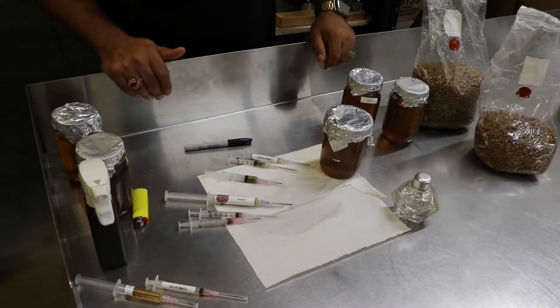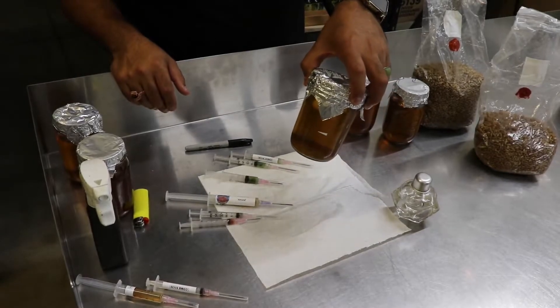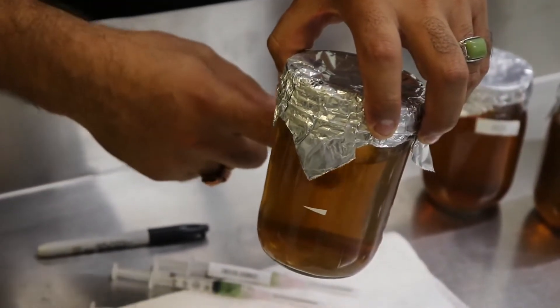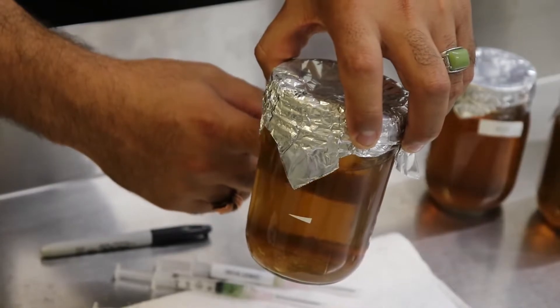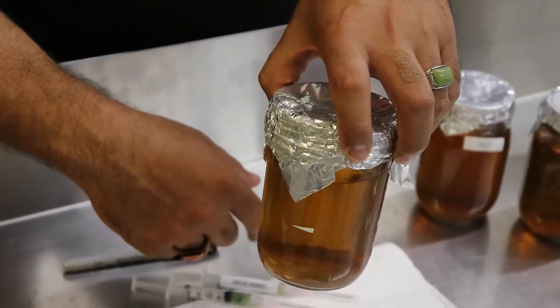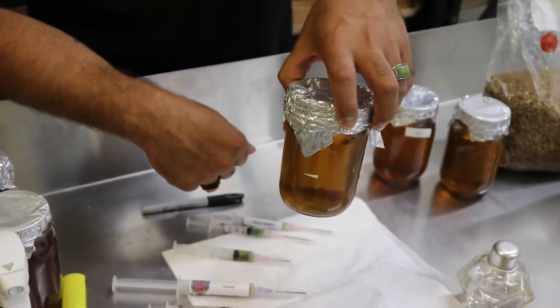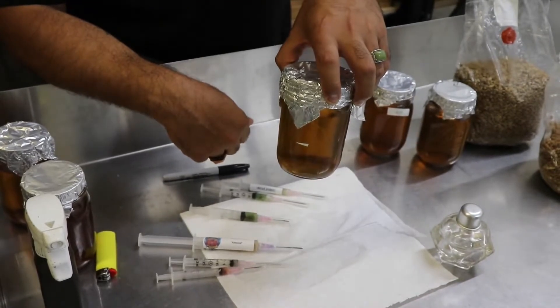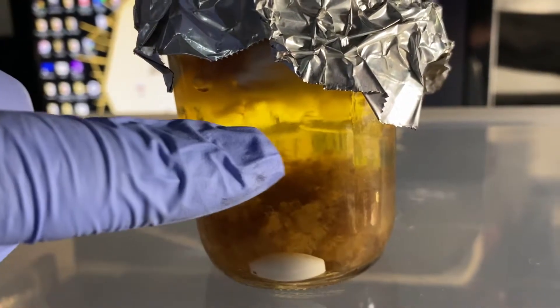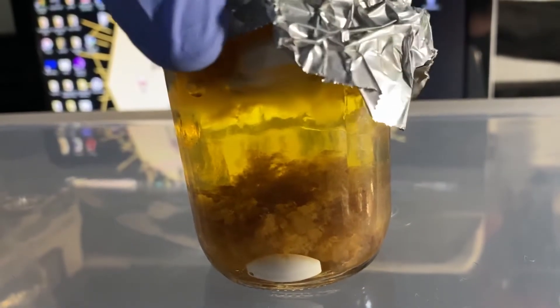Now we're gonna inoculate this liquid culture — the one I taught you how to make in the other video. As you can see it is clear; you can see my finger through it on the other side. That's what a liquid culture should look like when it's sterilized. If it's foggy or cloudy and you can't see through it, that means it's gone bad. I'll show a still shot of what the liquid culture should look like once it's colonized — little clouds of mycelium floating around — but the liquid part will still be clear.